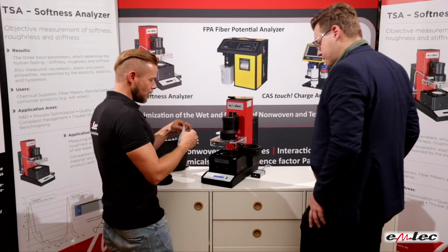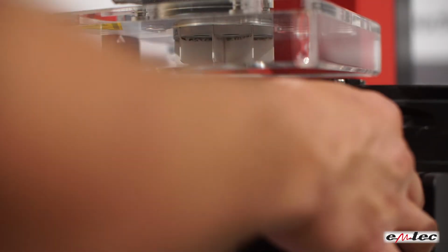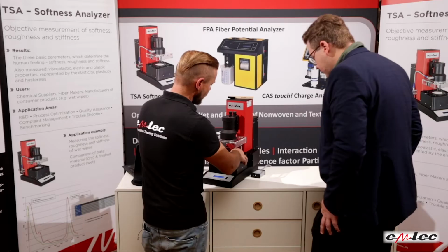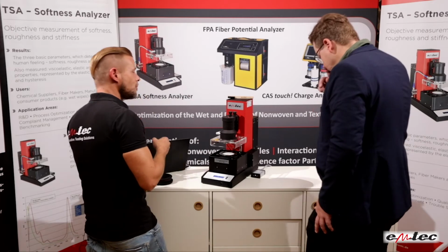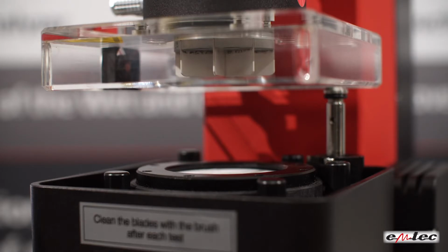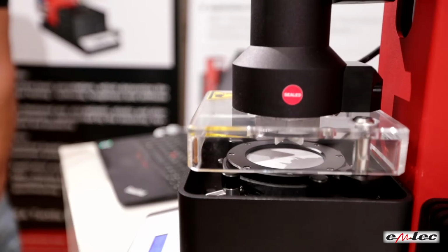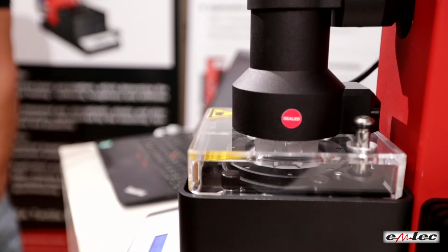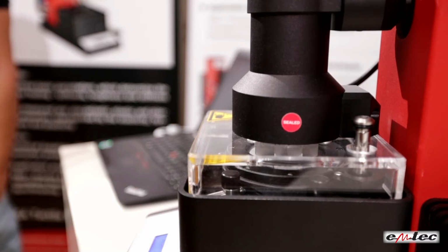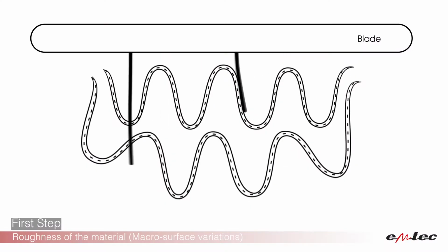What we do is we put the sample into the device. So to measure, we place the sample right here. We close the fixing ring, and we close the handles here. Now you push start in the measuring software on the PC. The measuring head would come down to the sample. With the rotor and the blades, we apply a load of 100 milliNewtons on the material. Once this load is reached, the rotor starts to rotate over the material, and by this rotation, a vibration of the material itself is caused.